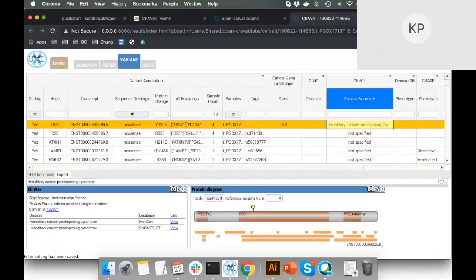And with this kind of informal live demo, I think I'd like to stop and see if there are any questions or clarifications.